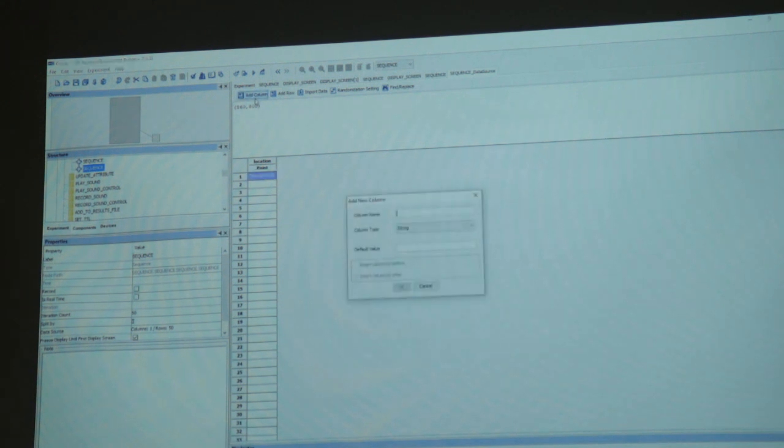So I will just add another type of column for the sake of it. Let's say the ring had color. Let's say the ring has multiple colors. So let's call it color, and you select the type color. Once you select the type color, now instead of 2 values, you have to give 3 values, which is RGB.